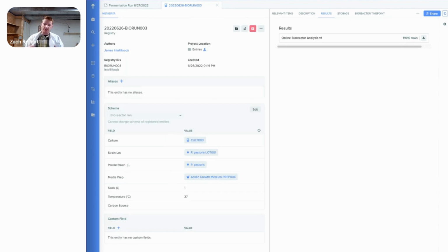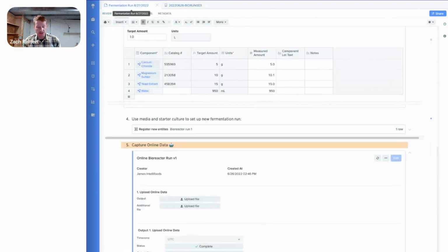What I want to do next is, again, switch back to a different role and talk more about our simplified permissions. Again, it's great that we have all these features. We have the ability to run performance data at scale. We also need to make sure it's secure.